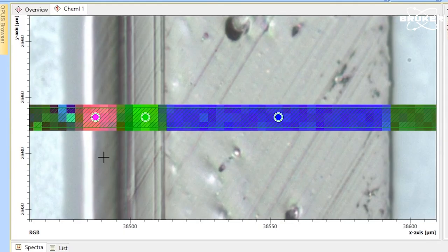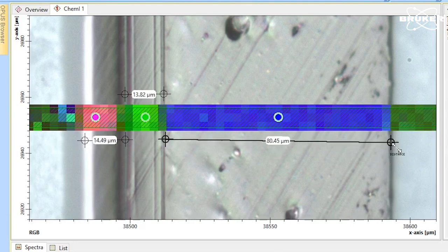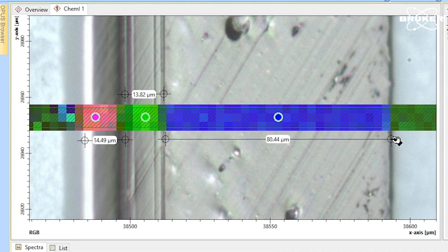Using this data, we can create a chemical image that allows us to visualize the thickness of each individual component. The different colors also indicate the materials used in this multilayer film.